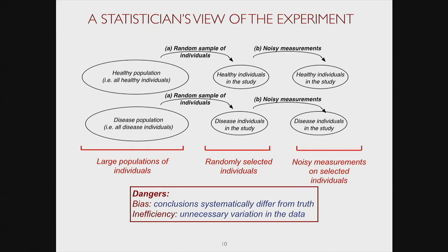So once we agree that we talk about class comparison, now we need to think about more details of how exactly we are going to proceed with the analysis. And so when our collaborators come to me and say, well, now that I know that I want to do class comparison, how can I design the experiment in the best possible way?